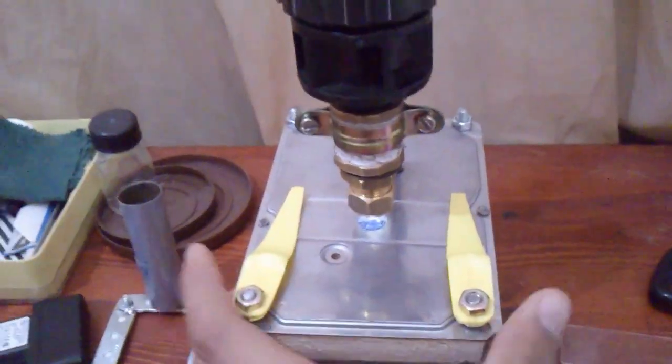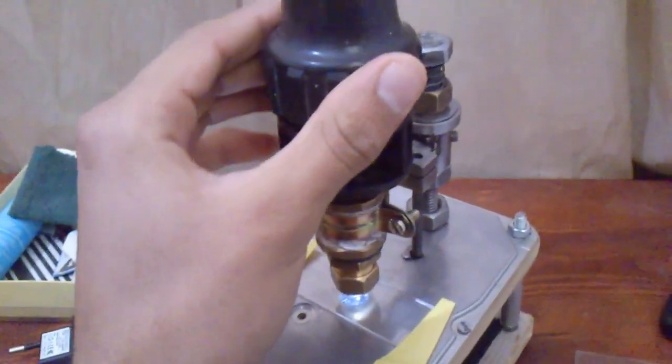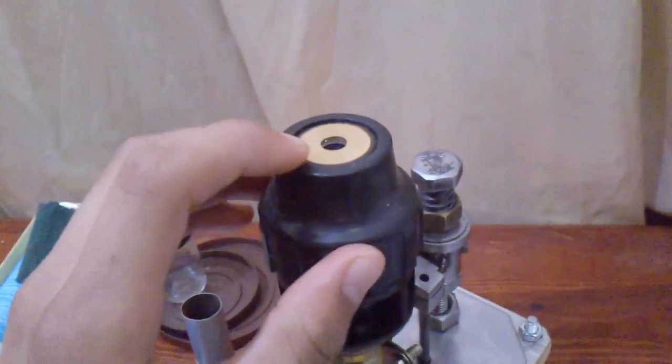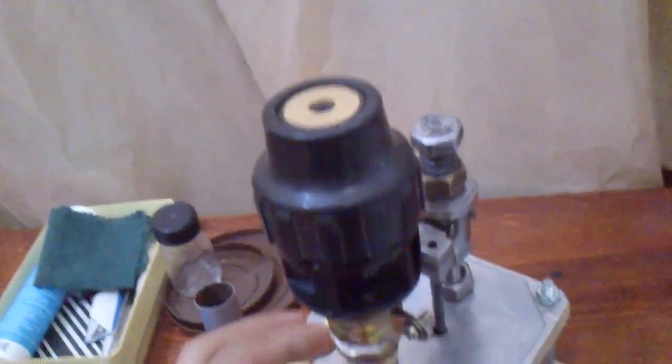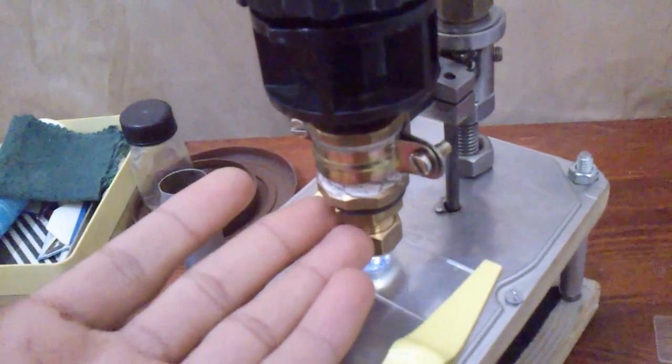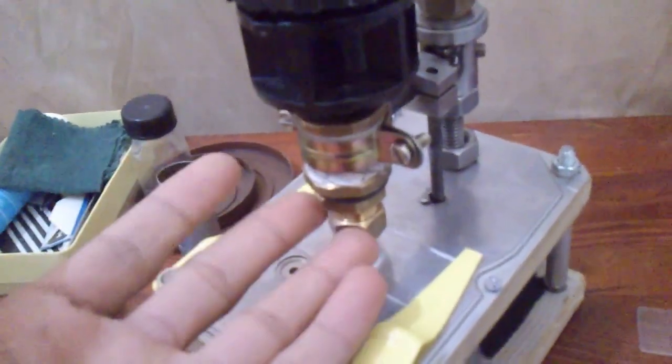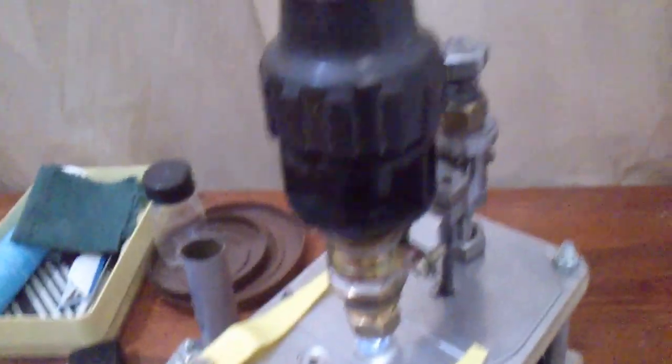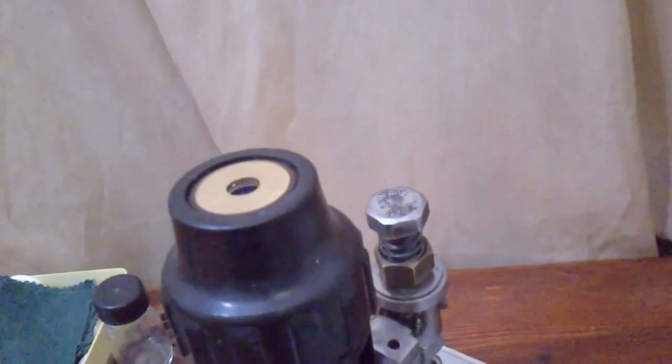But with the improvements, I will talk about the details. Let's jump to the microscope. Here it is. The microscope is, as you can see, not like it was before. I have used better materials like copper water tube components that allowed me to fix the lenses in their places.